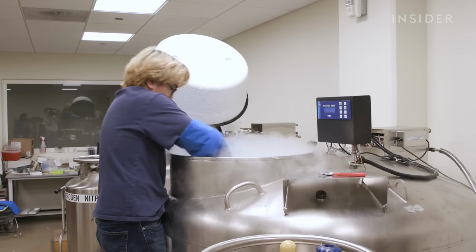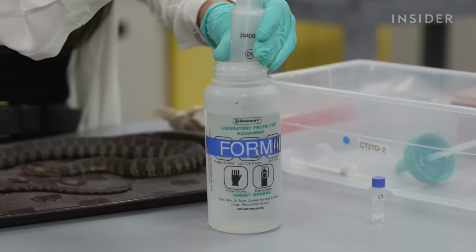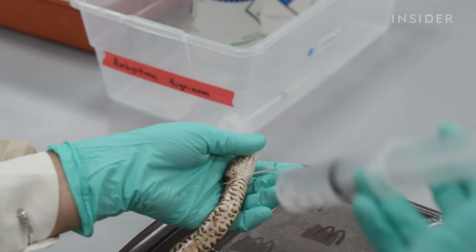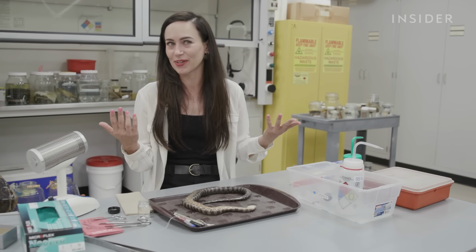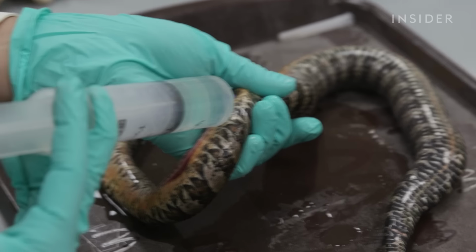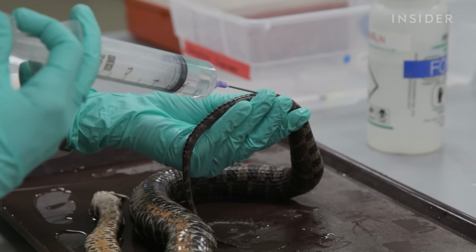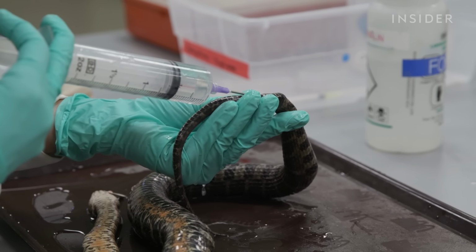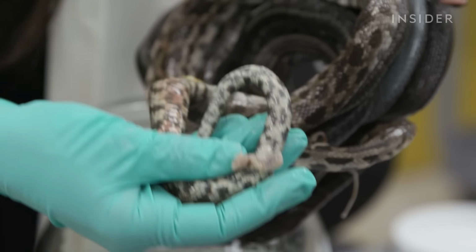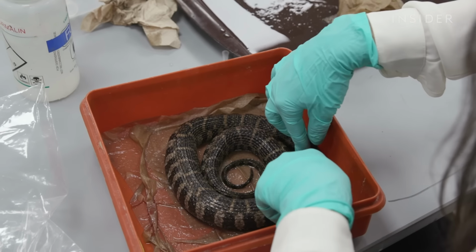Then the DNA goes into these massive liquid nitrogen freezers with thousands of other DNA samples. Now she's ready for formalin, the liquid that preserves the tissue and keeps a specimen frozen in time. It's sort of like embalming it, just like a person at a funeral home. Sarah has to keep in mind what info she needs now and what researchers might need in the future, like the sex of the snake. It's always good to see if it's a male snake, if you can find the hemipenes and pop them out. Sarah will pose the snake so you can see the visible penises from outside the jar without even opening it. In this pose is how it will stay for the rest of its afterlife.